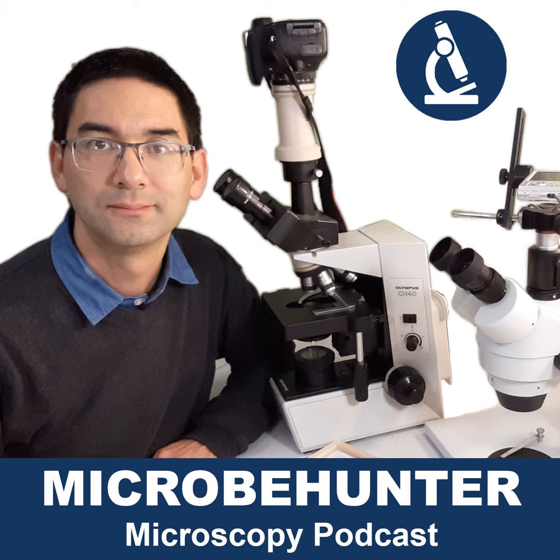So the question is now, when would you actually need a 100 times oil immersion objective? Are there any cases? Well, first of all, yes, there are specific cases, specifically if you want to look at, let's say, chromosomes, or if you want to look at bacteria and see them a little bit larger, then I would recommend a 100 times oil immersion objective. However, I only recommend it with reservations, because there are certain disadvantages as well.